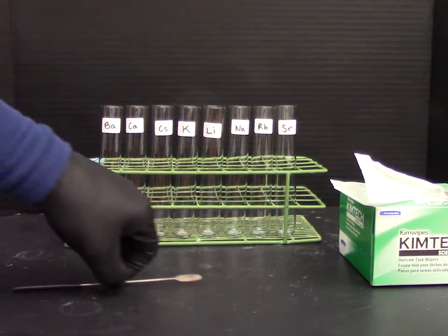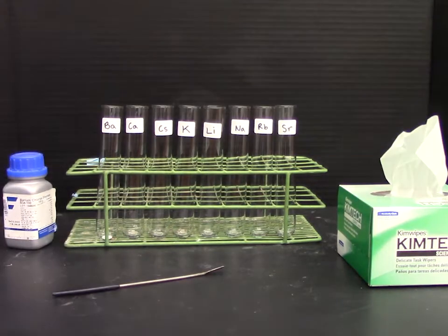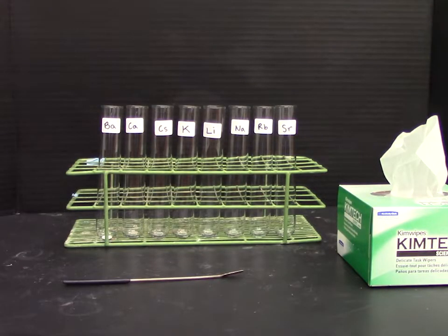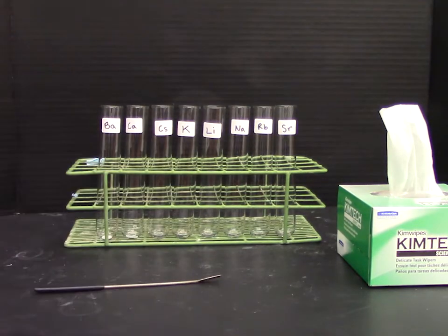We'll start by taking a spatula and dispensing a scoop of each standard into its own test tube. If you use the same spatula for each standard, make sure to wipe it down with a Kim wipe before using it in a new bottle.